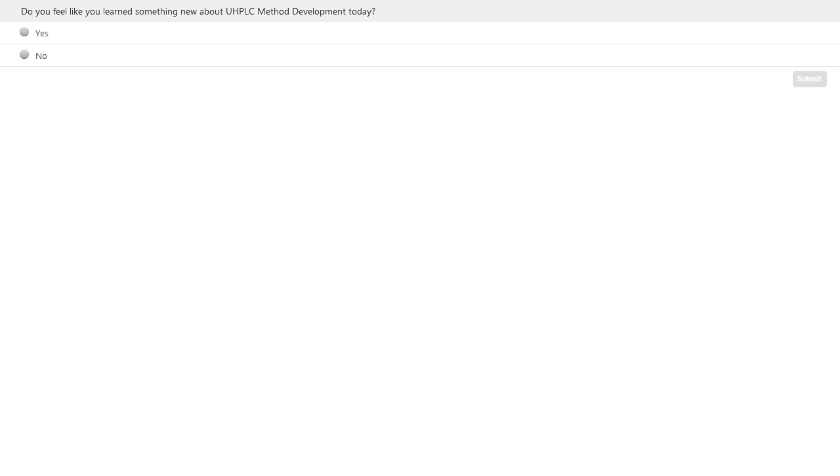Someone asks, other than examples between UPLC and HPLC, do you have any examples for analytical HPLC to prep LC? That's a very good question. Actually, I have been doing some work on preparative HPLC, and I did test out the translation calculator to see if it worked, and it does work. The big difference with analytical and prep is that we're normally overloading our column when we go to prep.